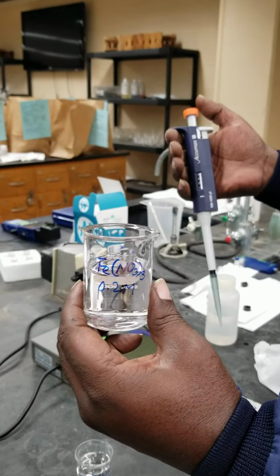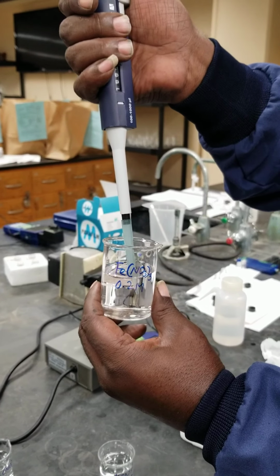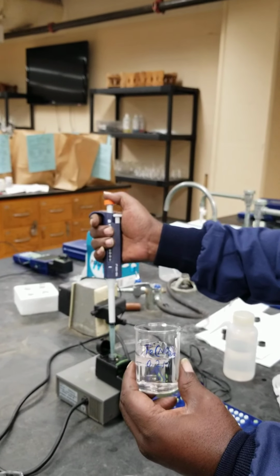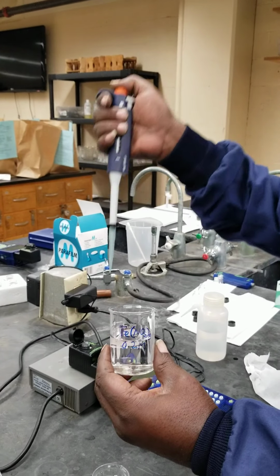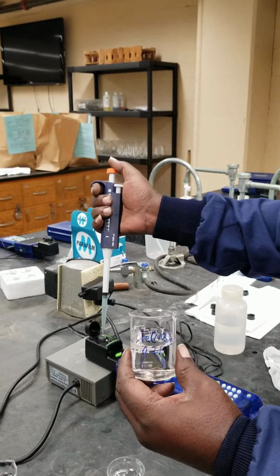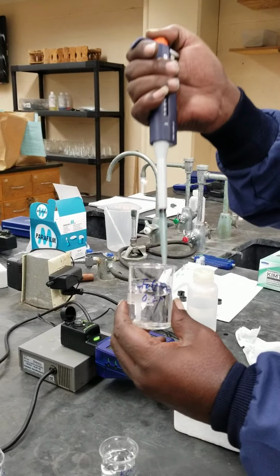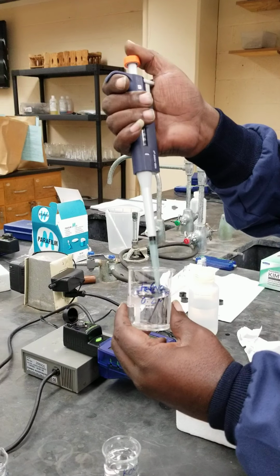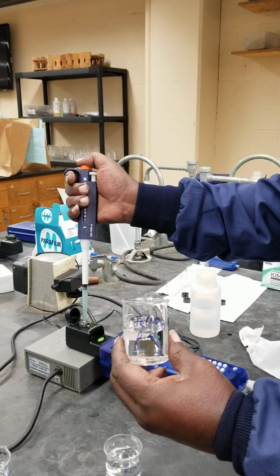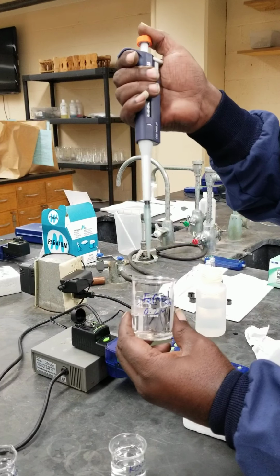Yep. All right. To the first resistance point, draw up the solution slowly. Put it in. 1, 2, 3, and 4.